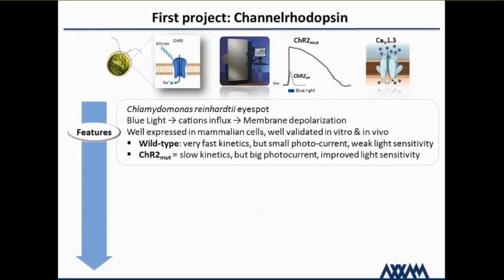The first explorative project that we ran was a Channelrhodopsin. This protein derives from a unicellular alga, Chlamydomonas reinhardtii.